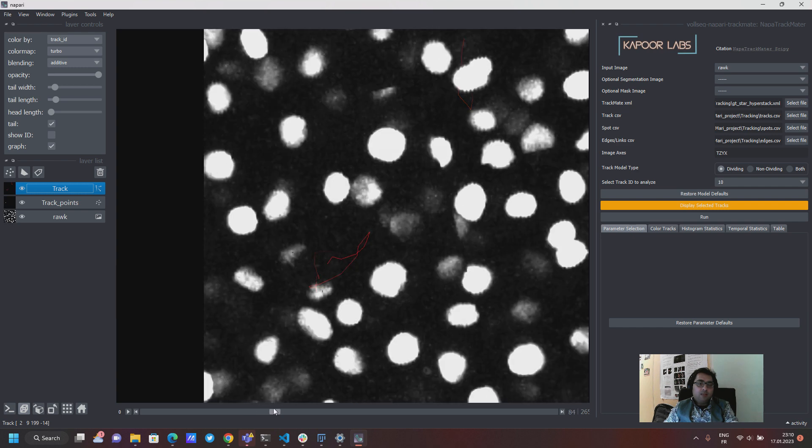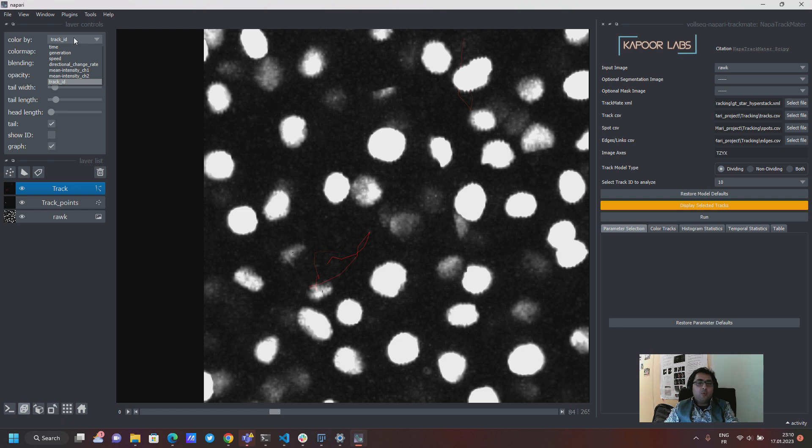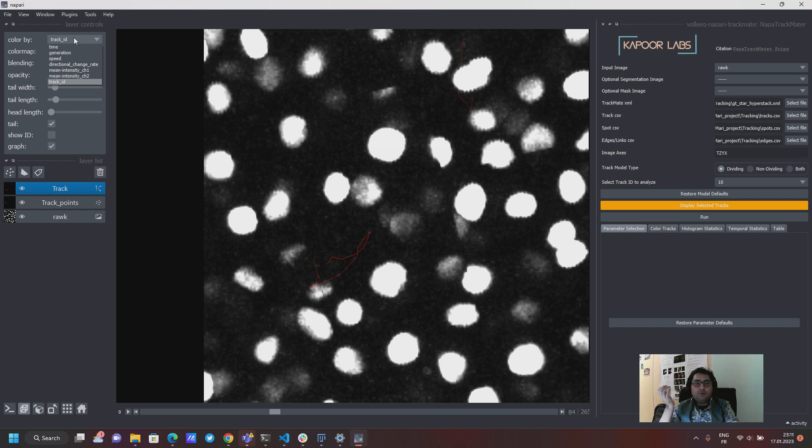So for this you have on your left hand side this dropdown menu where you have certain properties like the generation of the track. If it starts from the root which is the top of the track, that's where it starts and then until it divides it's generation zero.